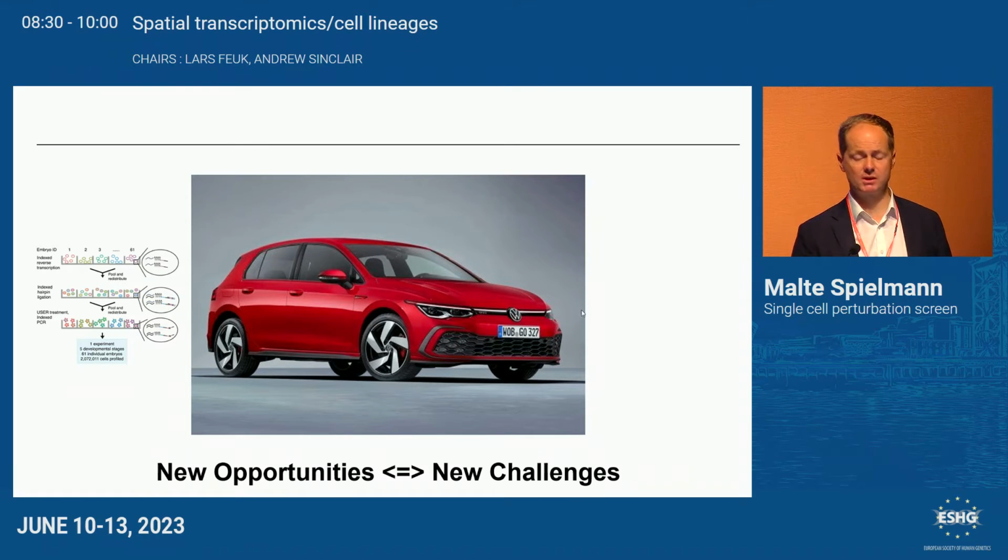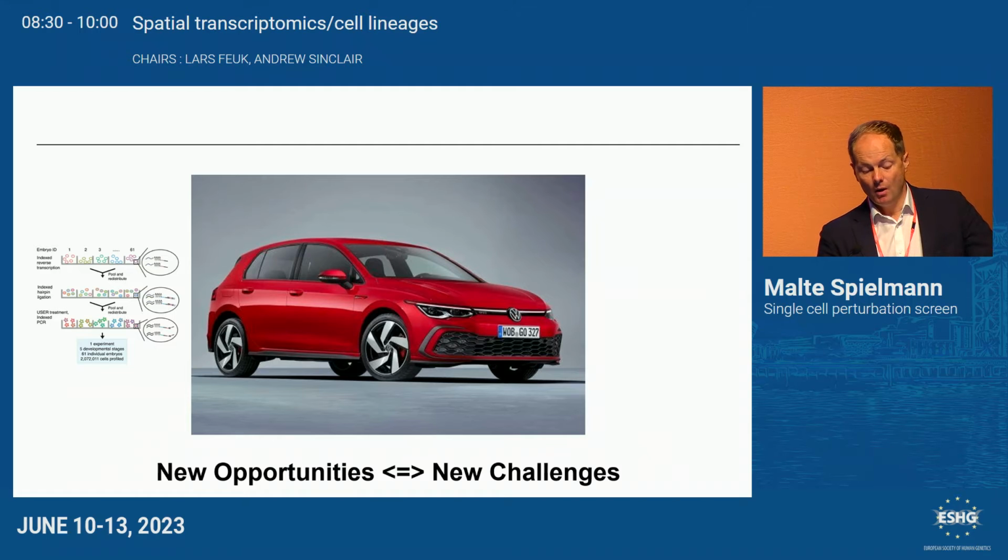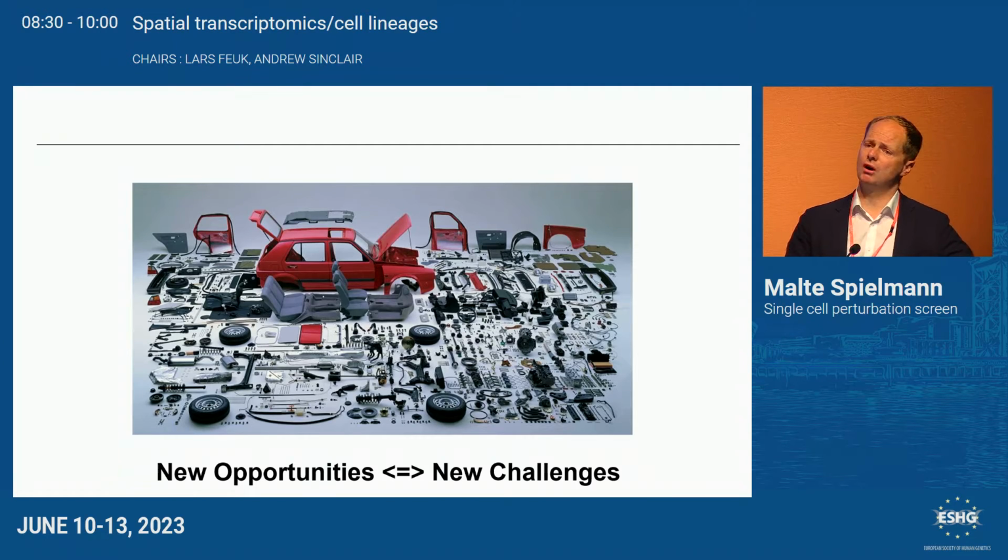And let's compare it. Usually people talk about a smoothie. I like this one better here. So we have a car, which is nowadays very complex. And now, by single-cell RNA sequencing, or we call it sci-seq, single-cell by combinatorial indexing, we can take this car apart, right, into all its original pieces. And this is really nice. So my daughter once did it to my phone. The problem is I could never fix it back together, right? It's easy with some things, so like this is probably the tire, but I'm not sure about all these pieces. So basically what I'm saying is we have a technology to see all the different pieces, but what do they mean in biology? That's more difficult.